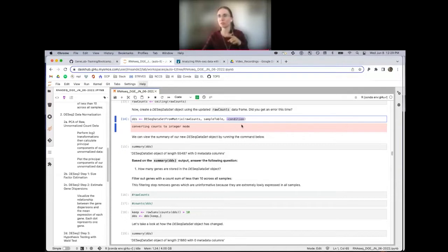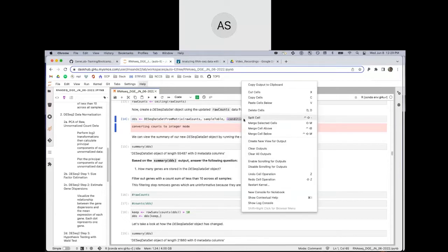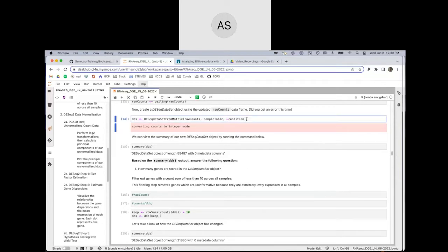That is one of the values that we generate. You will notice we didn't do it here just for simplification. We only really have the two groups. For any study that we have on GeneLab, all the pairwise comparisons that we can make, we do them pairwise in both the forward and opposite directions, like we're doing flight versus ground and ground versus flight. We would do that for all groups in a pairwise manner, and that would generate the Wald statistic for each one of those pairwise comparisons. But then we also generate the likelihood ratio test that compares all groups as well. So you'll notice in our DGE tables, if you download them from the GeneLab repository, you'll see an LRT column, and that value would be the likelihood ratio test value that compares all the groups in the study. Got it. Thank you.